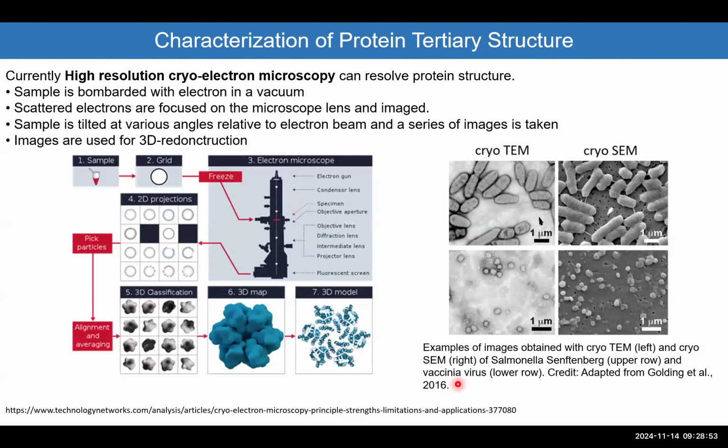Now, the last technique I will show you is the cryo-EM. And for those who would really go for research in their life as a career, and they like microscopy and they like studying the structure of proteins, I would really recommend that you go to learning the cryo-EM. It's one of the most powerful techniques and the most needed, I would say. You will be one of the researchers that everybody wants to collaborate with, and it will be very easy for you in the future to get positions.